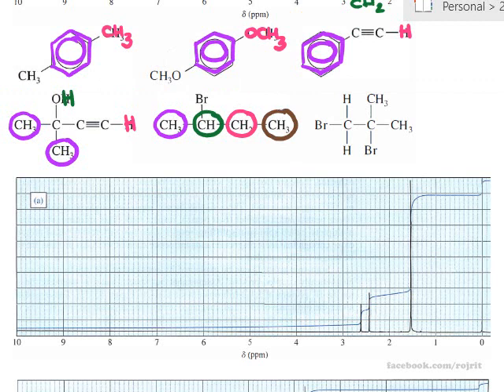And the last molecule, firstly you have CH2, which is the same, and again you have CH3. These 2 CH3 are the same as well, so you have 2 types. The only molecule that has 3 different types of hydrogen atom is this one. So this is A. Okay, I will put A over here.